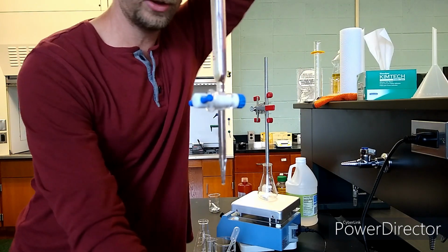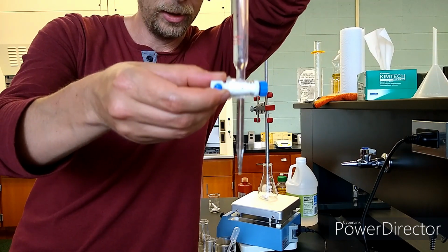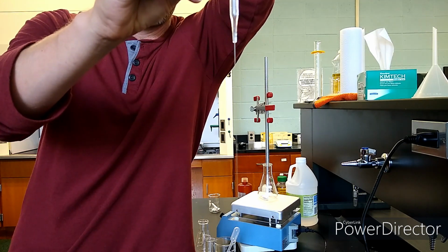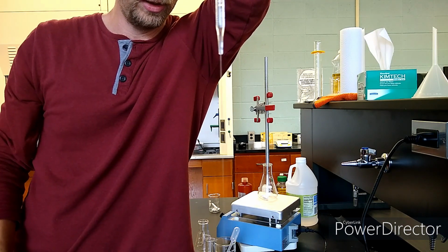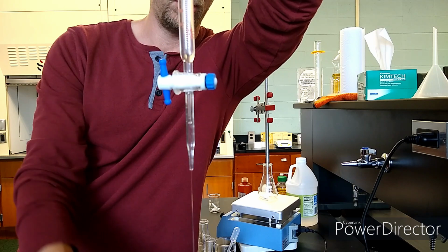And do you see any leaks? I don't see any leaks. It's looking like it's holding. Now let's open it up and see if it drains. Yes, I got a beaker down there to catch it. It looks like it's draining very smoothly. That's good. That's what we want.